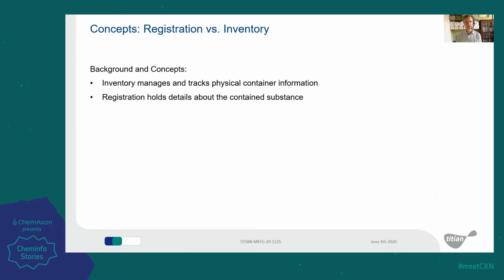So inventory we think of in terms of managing and tracking physical container information, whereas registration is all about holding details about the substance contained in those sample holders.